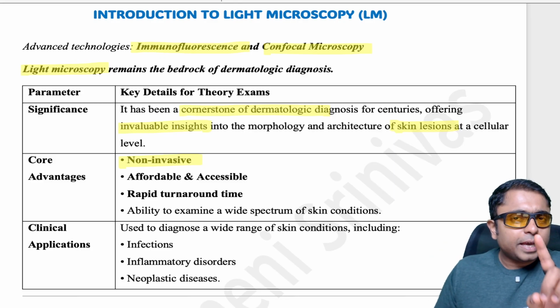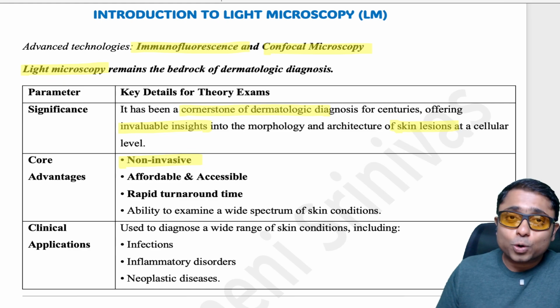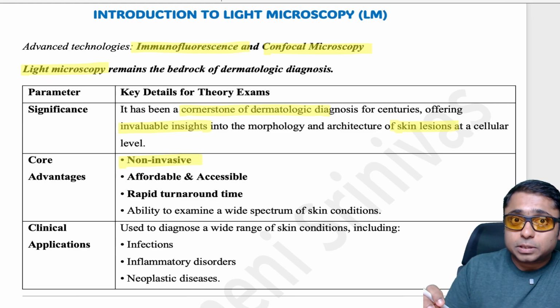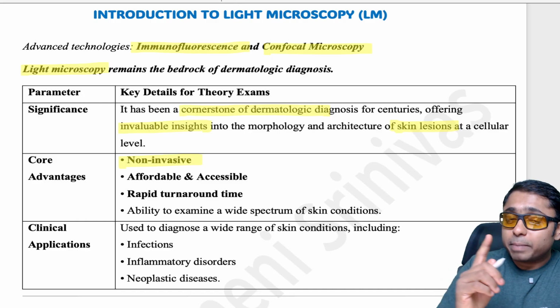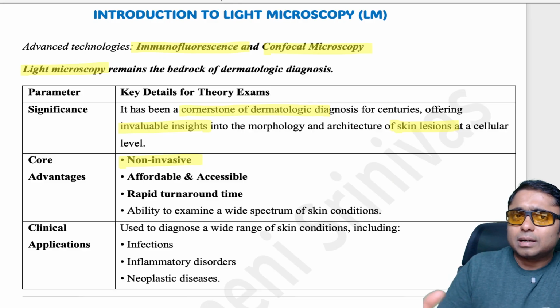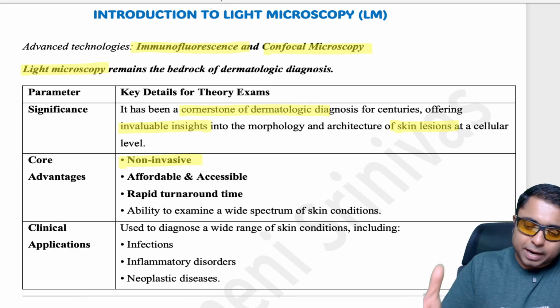And if your department has a microscope lying in the corner with all the spider webs, then my suggestion, my order, will be: make use of the microscope. It is a very important diagnostic tool which is easy, affordable, and accessible.